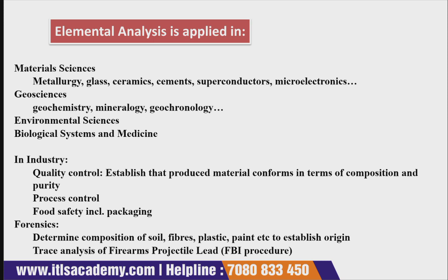Now comes the environmental sciences. Whenever you want to identify the amount of different types of pollutants present, you can use elemental analysis in determining that. Then comes biological systems and medicines.